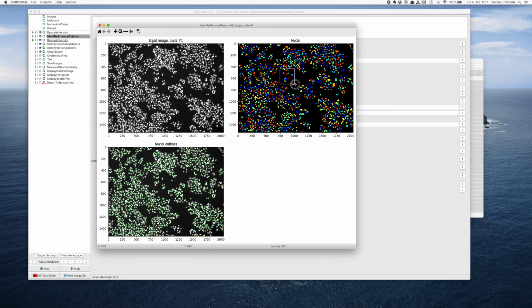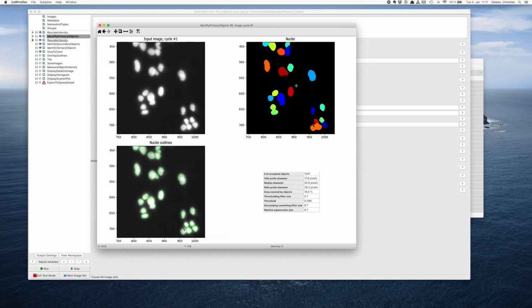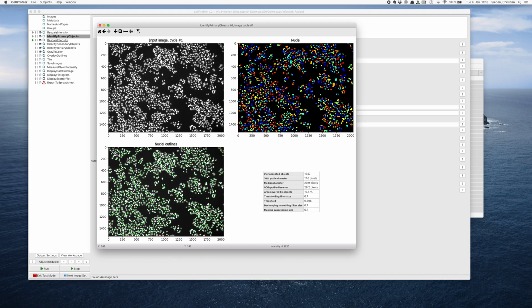If we go to areas that are very loose, like here, it's quite easy for CellProfiler to identify the nuclei. You can already see here, this one is sort of clumped together, but they are still divided. Here they are not. And this is something that is really hard to avoid. So there are always areas which are not as well segmented as other areas. So that's really part of the segmentation. It's sort of a compromise that will always have some trouble in very dense areas.